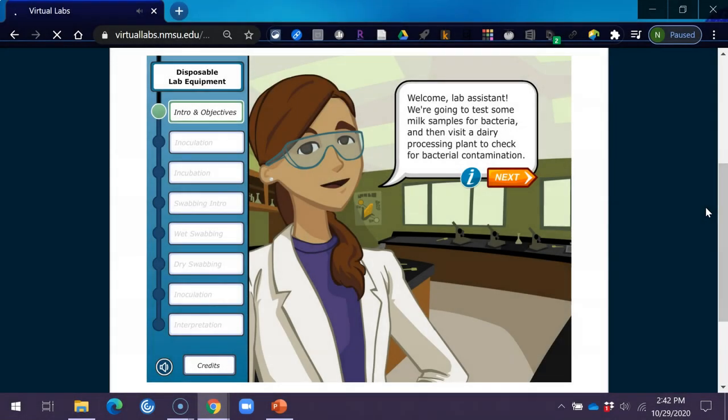Welcome, Lab Assistant. We're going to test some milk samples for bacteria and then visit a dairy processing plant to check for bacterial contamination.